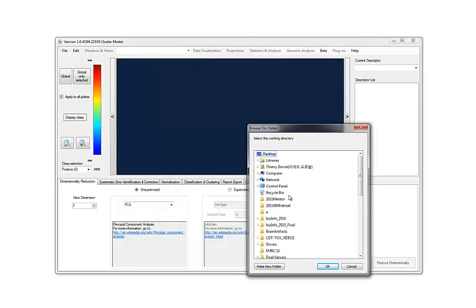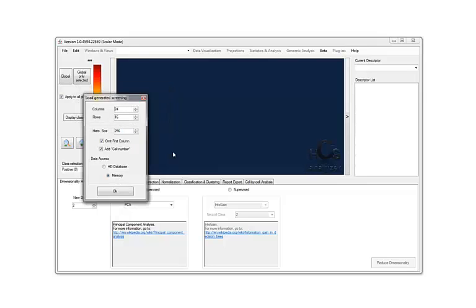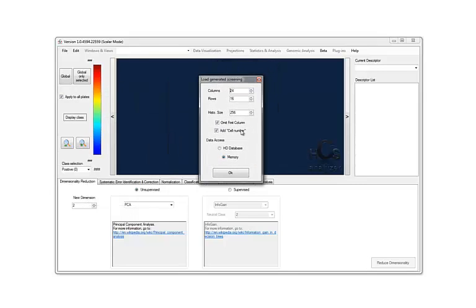Then what you have to do is to define a directory where you will store your database. Let's do this. Now the CSV file is loaded and converted into a SQLite database. This database can be used directly afterwards. You will not have to generate this database again. Once it's finished, this window pops up telling you how to open this database.